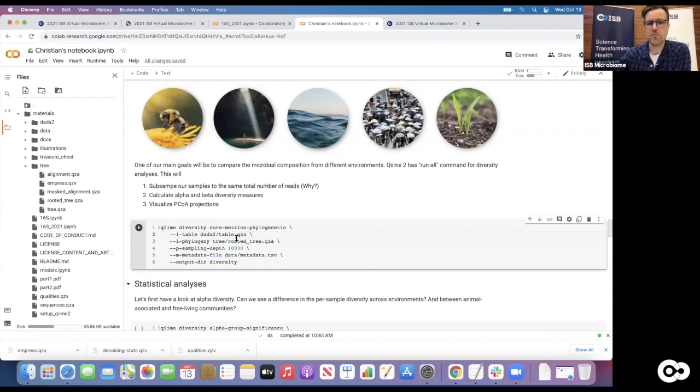And you can't really control for that very well. Even if you're really perfect in pipetting, and honestly, nobody is, when you load it onto the sequencer, you will always get variations across samples because it's basically random. It's such a nanoscale thing that the sequencer does that it often happens that reads from a single sample, when it does the cluster amplification on the sequencer, get pulled into larger clusters or something, which gives you a few more reads for a single sample. It doesn't really have any biological signal.